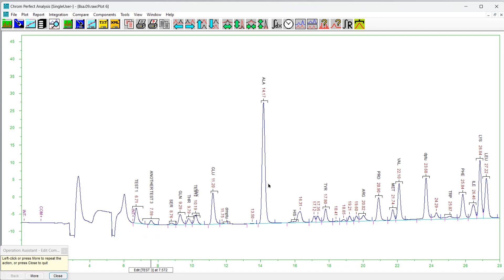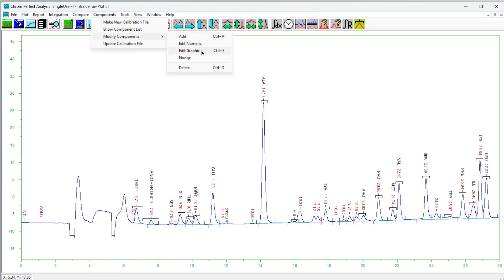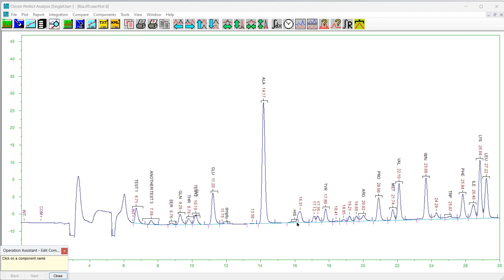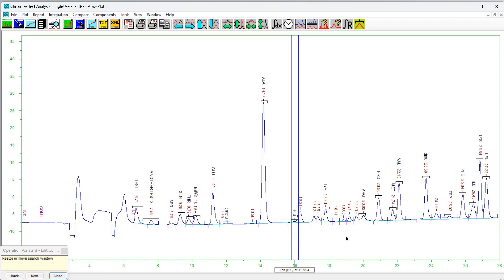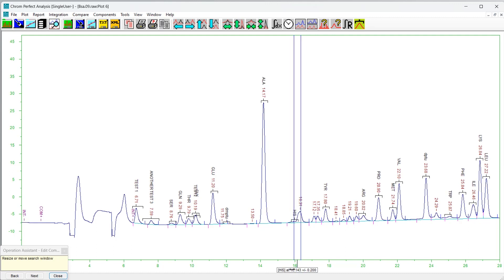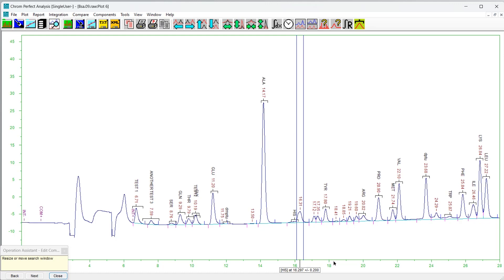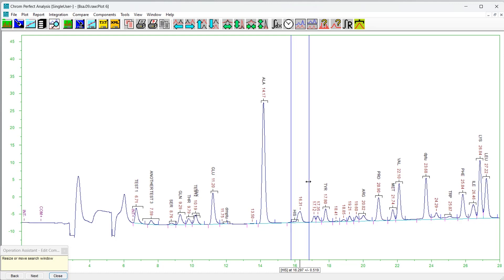To use the click-and-drag method, choose Components, then Modify Components, then Edit Graphic. The operation assistant form will appear. Click on the chromatogram plot and the nearest component will be selected. To confirm the selection, either press the Next button on the operation assistant or right-click on the chromatogram plot. Vertical lines and a temporary label will appear indicating the search window position and width. To adjust the position, click on the label and drag it horizontally. To adjust the width, position the cursor over one of the vertical lines and, when it changes to a double arrow cursor, click and drag horizontally.